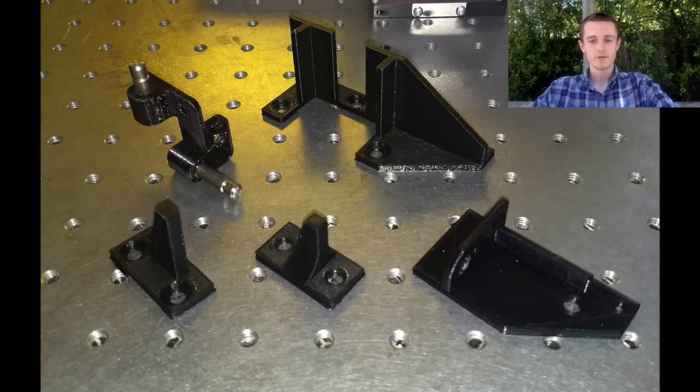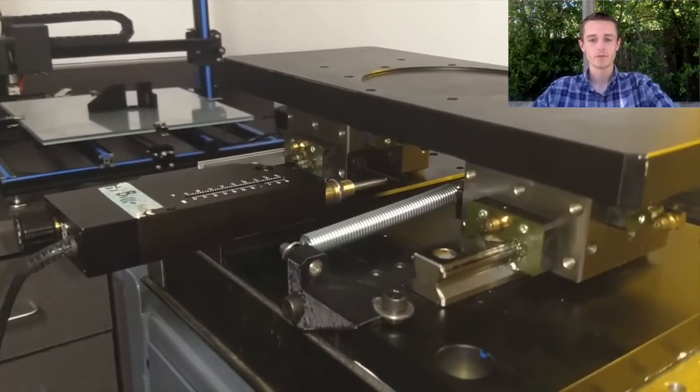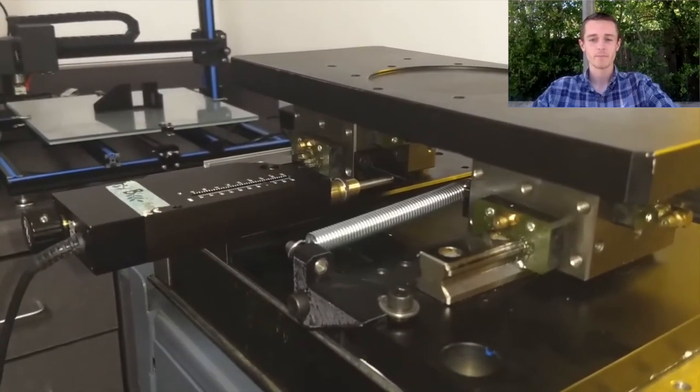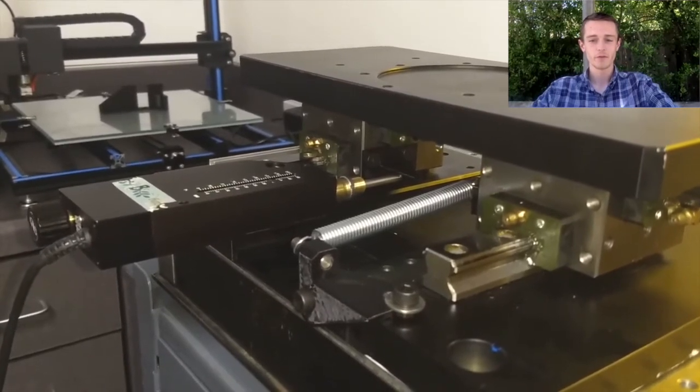Our design process involved optical system component selection and design for both microscope operation modes, staged bracket design for actuator positioning and spring return along each axis, and electronic actuation of the microscope stage in order to maintain precise and repeatable sample locating. We fitted an XY stage we purchased online with PLA brackets to facilitate linear actuation of the stage and a spring return mechanism to bring the stage back to its original position. Stage maneuverability is achieved using 2 linear actuators controlled by an Arduino.